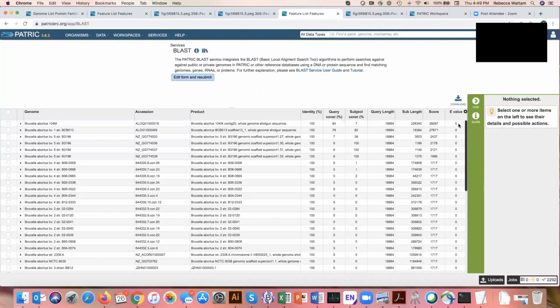And there's the score and the e-value. Okay, that looks pretty good. Then we have this particular genome that has 79% query coverage, and it's obviously a smaller little contig. You can see how it's smaller here compared to that one. So it's 82% there, so we've got less.